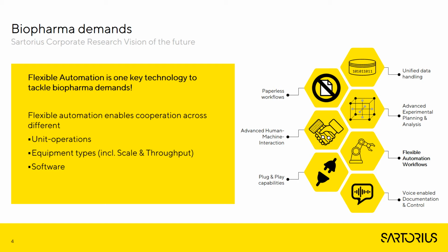The introduction of smart and user-friendly human-machine interfaces to reduce overall complexity. Bringing plug-and-play capabilities into the laboratory and manufacturing environment to reduce setup and automation efforts. Furthermore, enabling hands-free work by introducing voice-enabled documentation and control. Finally, the flexible automation concept was identified as an enabling technology to tackle the biopharma demands.